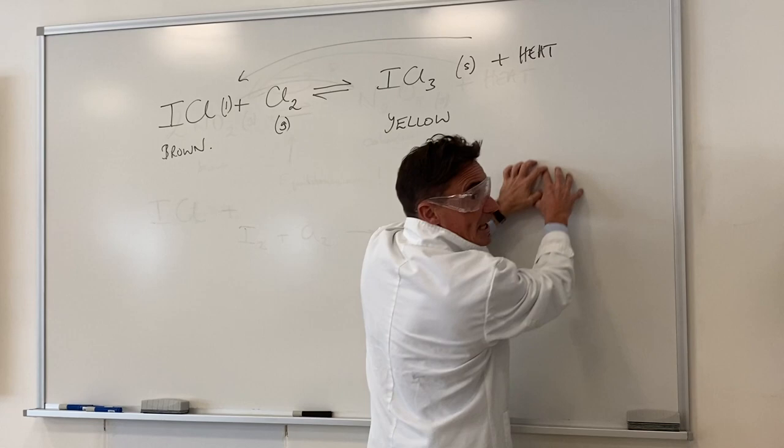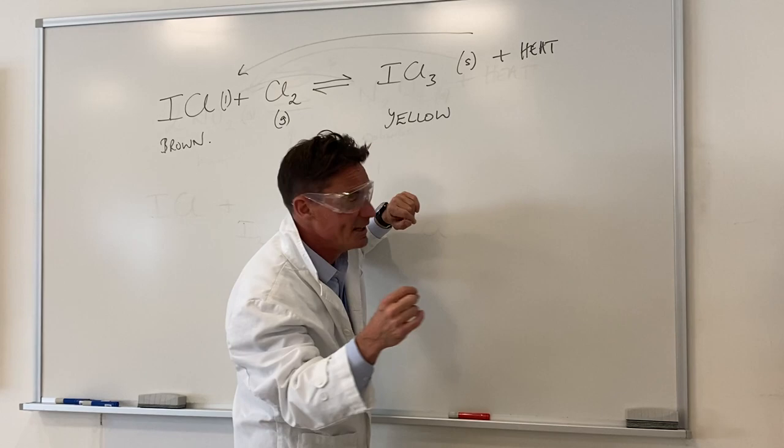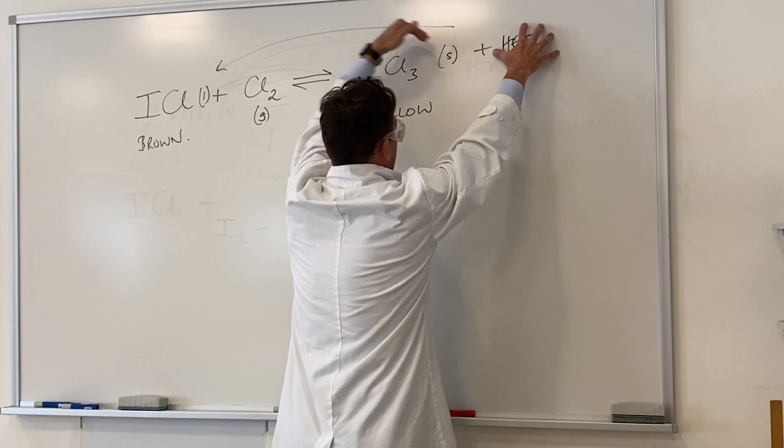Now, I'm removing heat as I speak. So we're going to try and get the reaction to move over to the right to replace the heat that was lost. So we should, as we go back to the fume cupboard, see more yellow stuff by Le Chatelier's principle. Again, the reaction at equilibrium will try to oppose the change you put upon it. So we're removing the heat, so it's going to try and replace the heat and form more yellow stuff. Let's see. Has that happened?